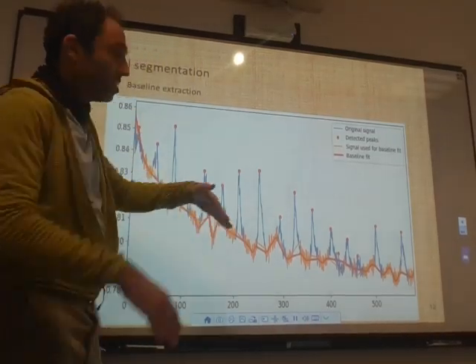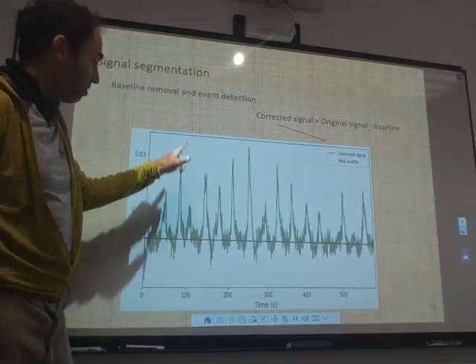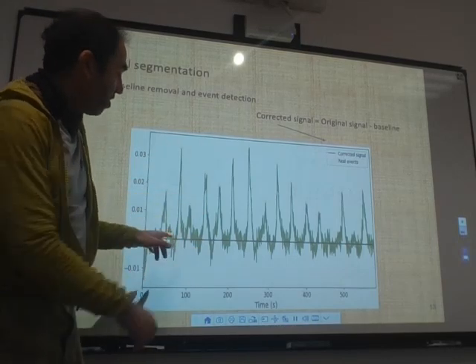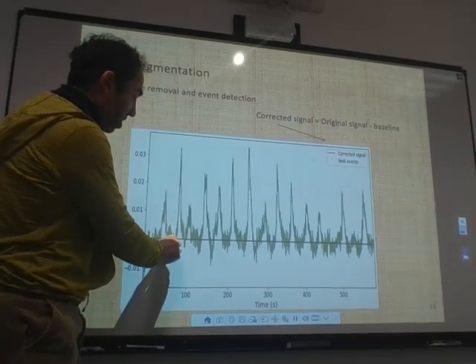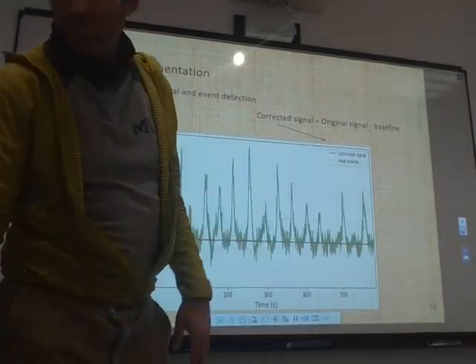If you subtract this, everything will be rectified, and during this rectification you get this result. So you get your maximum, you have your baseline now, and you can identify or do a further segmentation according to where you cross here this black line. Okay, but at least now you don't have any more this change in time.